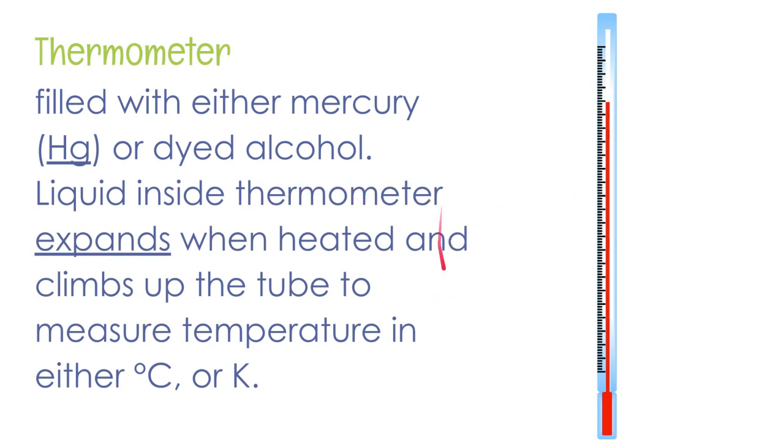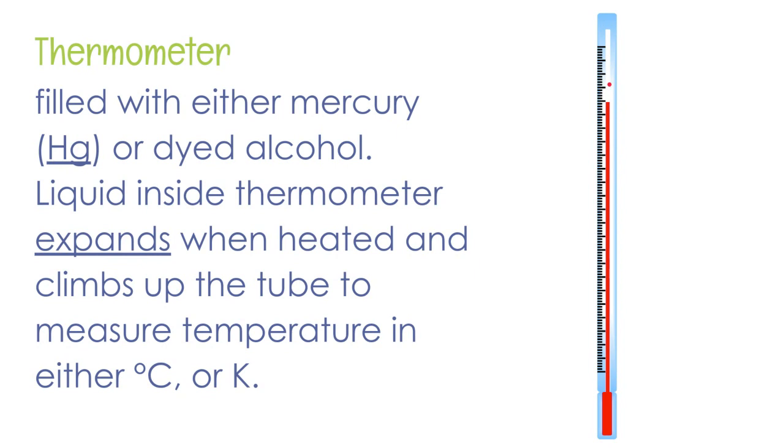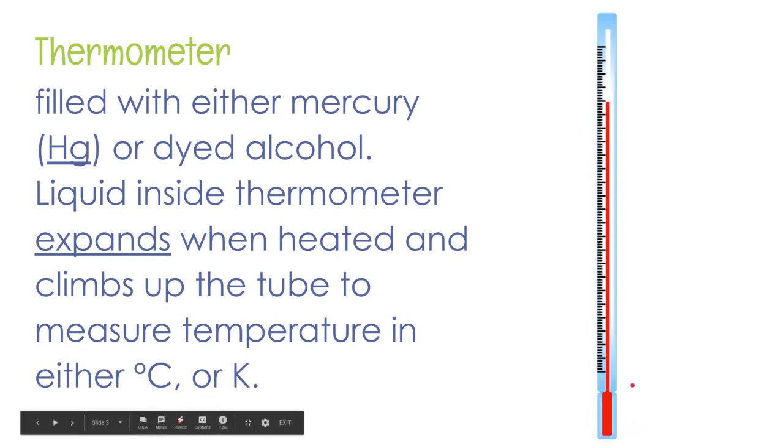What happens inside this thermometer is that when it's heated, this bulb has a pool of liquid in it, and when it's heated, all of the liquid in this tube is going to expand, and when it expands, it begins to climb up the tube, and then it will stop, and then you get your measurement. When your thermometer is measuring something colder than the air, the liquid in here is going to contract, or it squishes together, so all of this is going to fall down the tube, and it gives you a measurement then. Typically, our thermometers are measuring in Celsius, and then we need to convert it into Kelvin. Very rare to get a Kelvin thermometer.